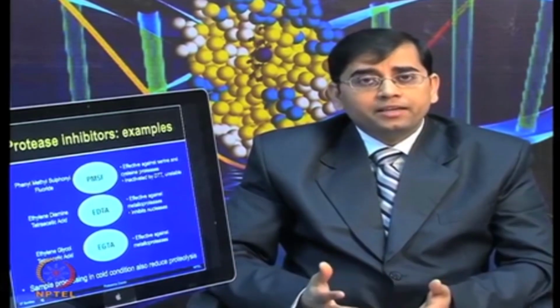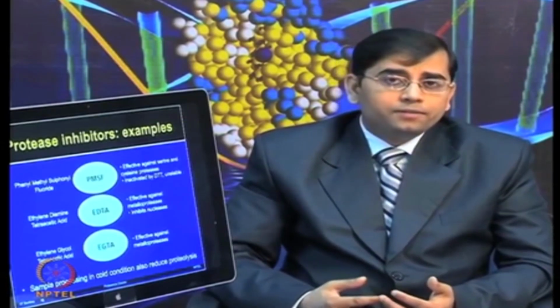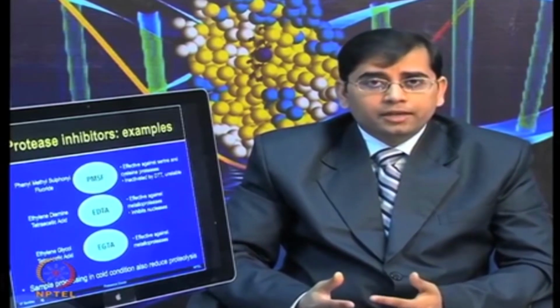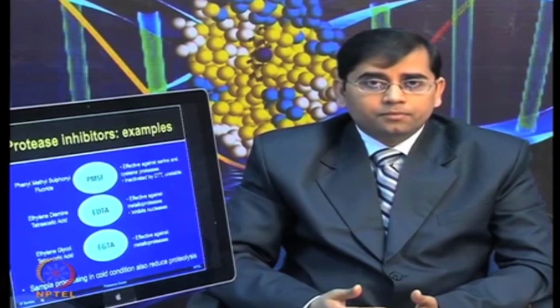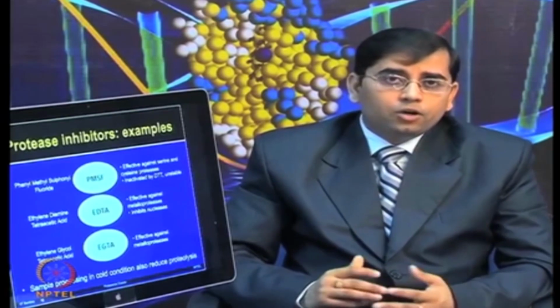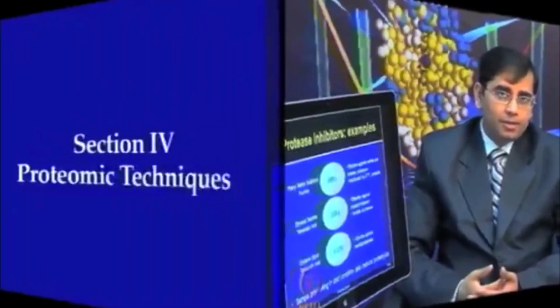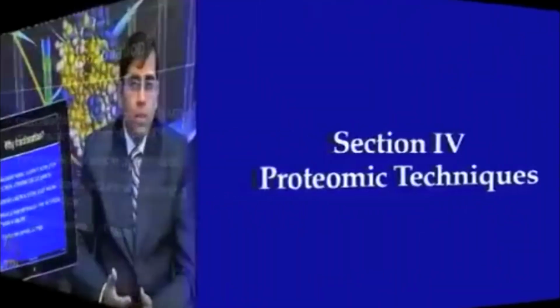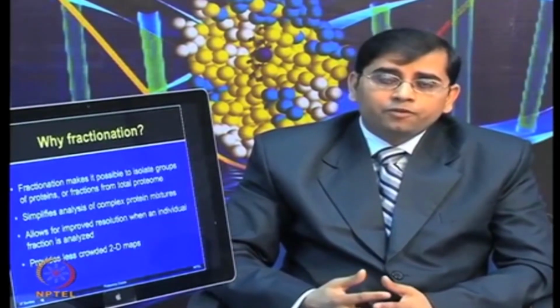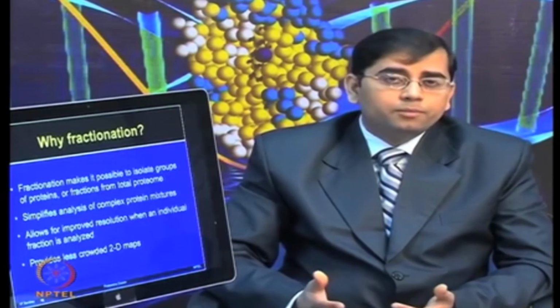Now, when you are making your sample preparation for proteomic applications, it is very important that you process the samples in cold conditions to reduce any proteolysis. These proteolysis artifacts can be minimized by using cold conditions during the grinding as well as during the centrifugation step. When you are applying your protein samples on 2D gel or other types of gel based proteomic techniques, this will provide you a less crowded protein map.